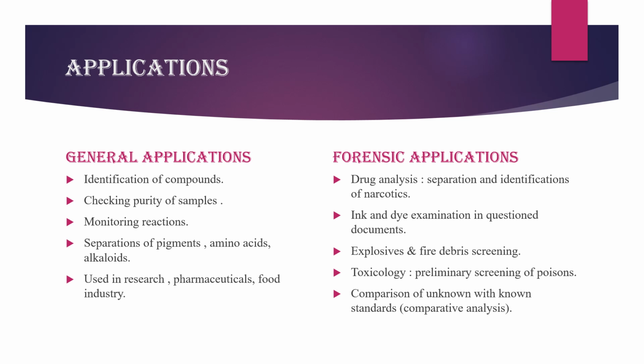TLC is used for identifying compounds, checking the purity of samples, and monitoring chemical reactions. It is also used for separating pigments, amino acids, and alkaloids. Because of its simplicity, TLC is used in pharmaceuticals, research laboratories, and the food industries.